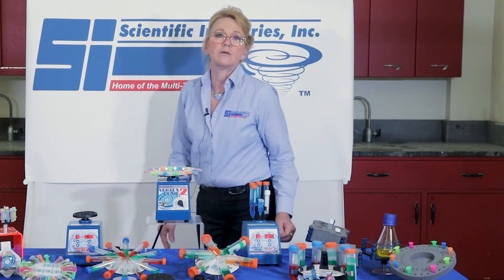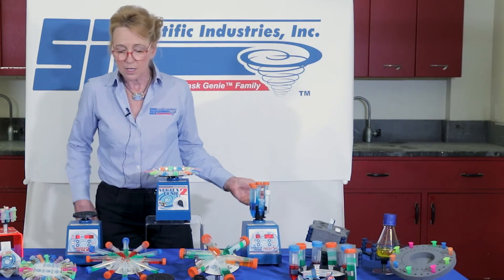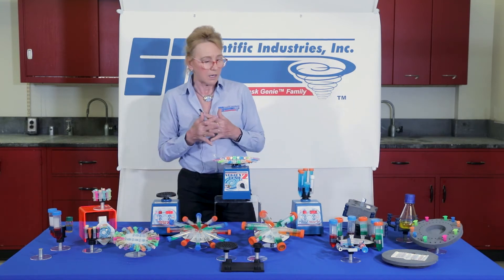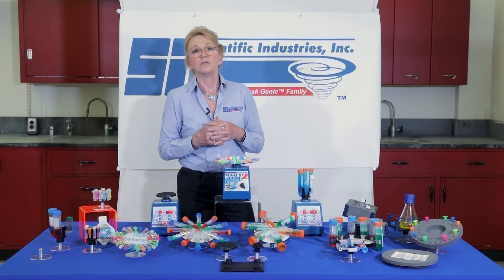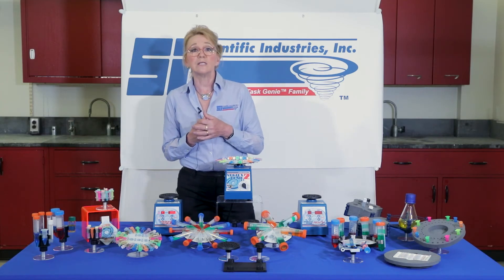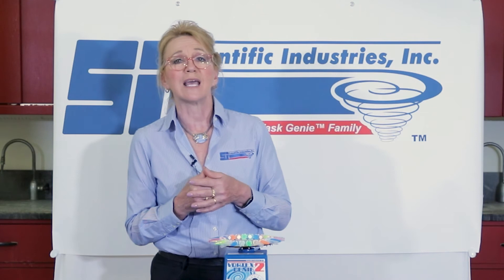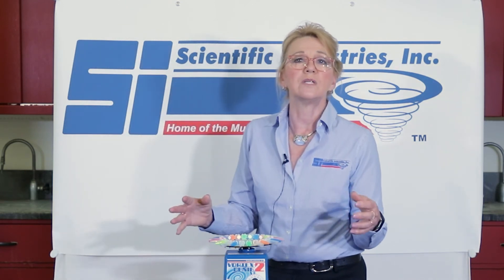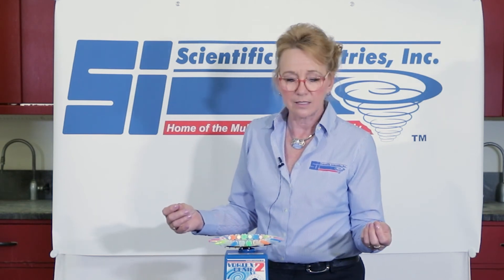On this particular accessory you can do up to six tubes, but as you can see we have a variety of other accessories to do more. The benefits of these accessories include hands-free vortexing, the ability to vortex multiple tubes at one time, transferring that energy into the tubes for more aggressive mixing action, and performing bead beading extraction methods.